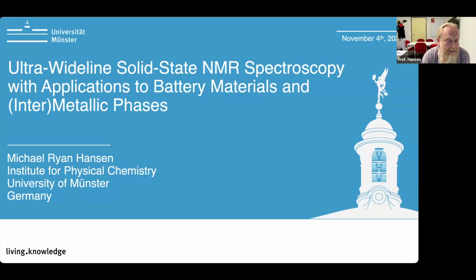So I will be speaking about how you can use solid-state NMR to look at battery materials and intermetallic phases. And for this, as you will also see later, you need ultra-wideline concepts, so how to perform broadband excitation, and so on.